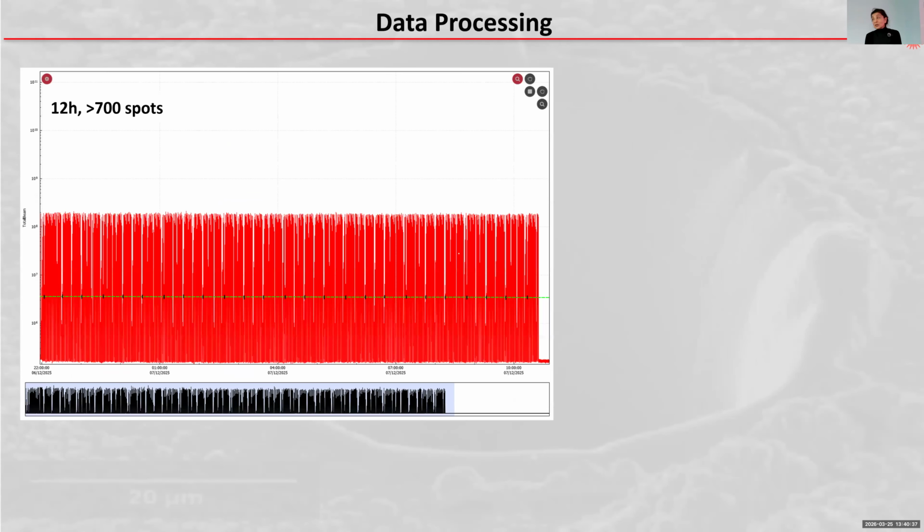Everything sounds very easy, and is actually not that difficult, except for the laser, because one spot analysis is typically, let's say for uranium-lead geochronology with trace elements, or for lead isotope analysis, about 1 minute, plus minus with a washout, depending on what sample material you have and how you want to design your project. But let's say 1 minute.